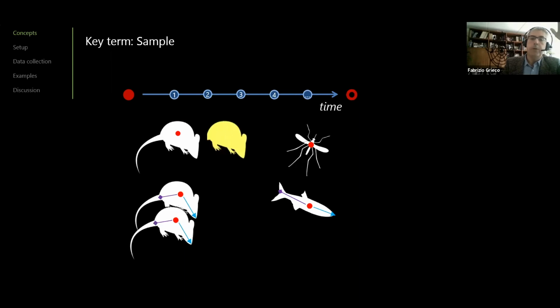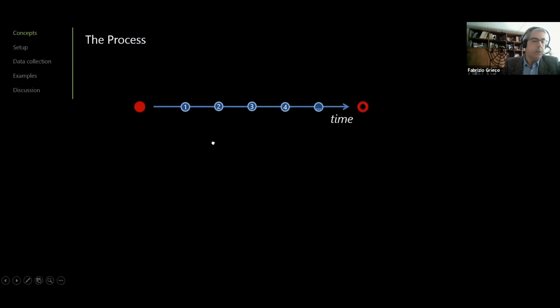Because together with the coordinates of the body points, you have extra information. You have, for instance, the body area, simply the yellow blob that you see when you track the subjects, okay? Or the elongation, which tells you something about the shape of the animal. So this is a number of features that are called raw data, and they are just contained in this box that is the sample. And every sample time you can use this data, like I'm going to show in the next slide.